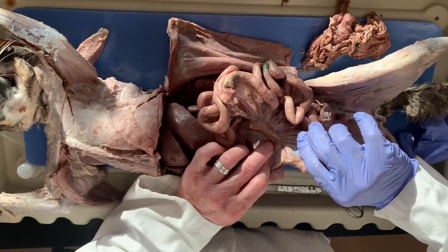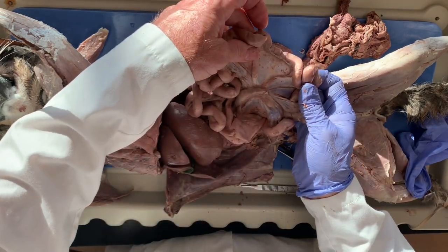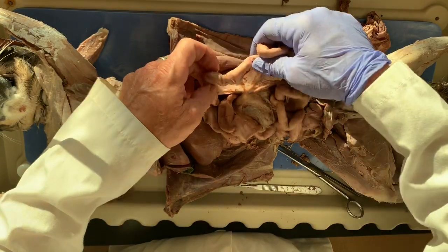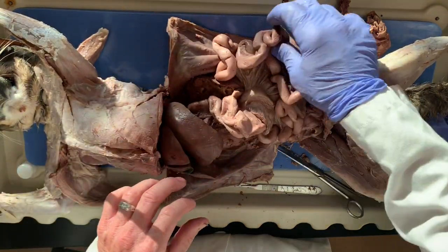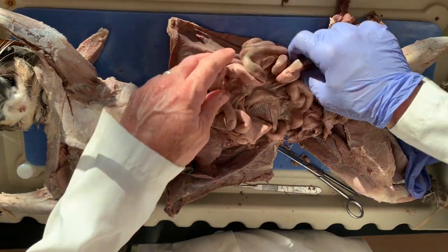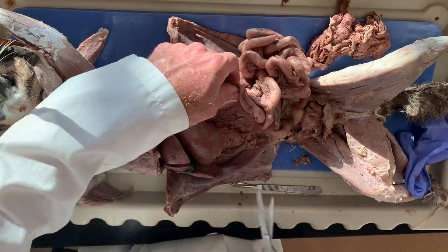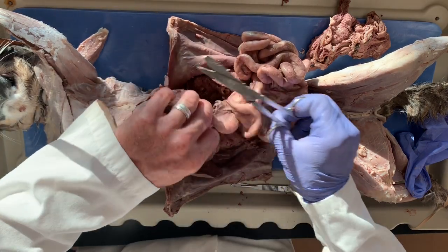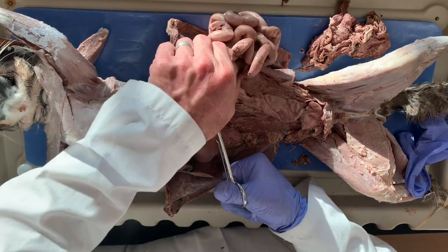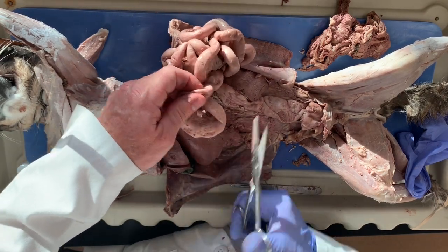And then you'll see these little nodules, which are lymph nodes, sometimes called Peyer's patches, within your intestinal tract, okay? This is all small intestine. Remember DJI: the duodenum, the jejunum, and the ileum are the three parts. So we have our end here, and now I'm going to break free all the intestines from the mesentery, okay? I just start in one place, and then make my separation all the way through.